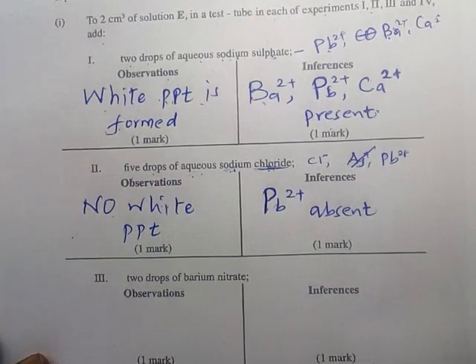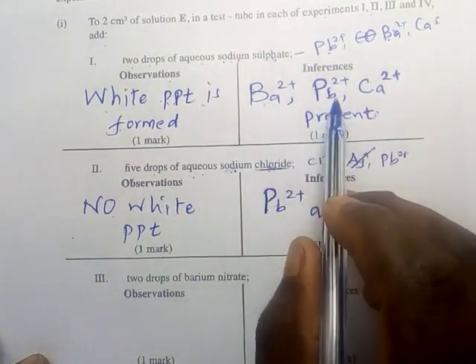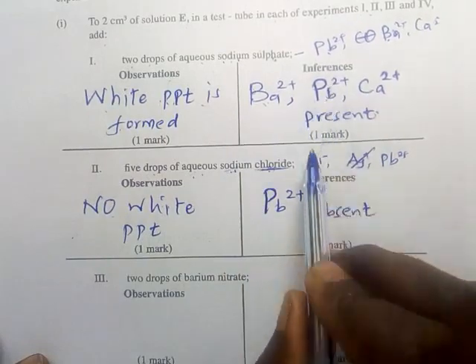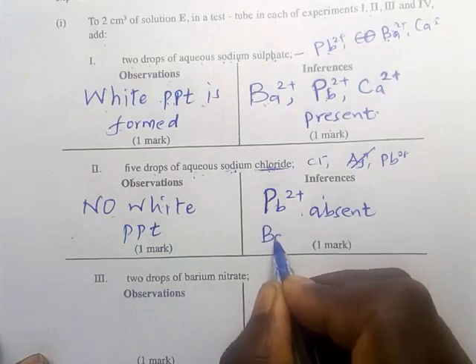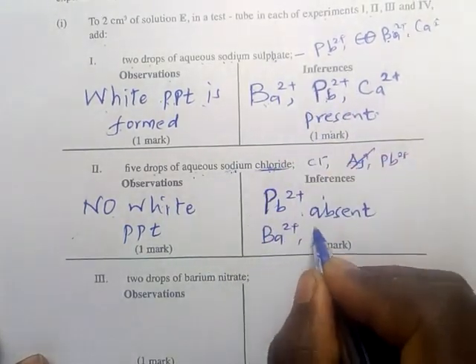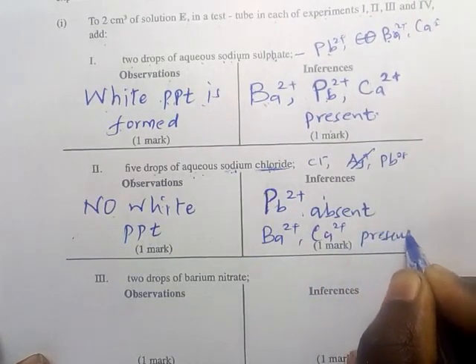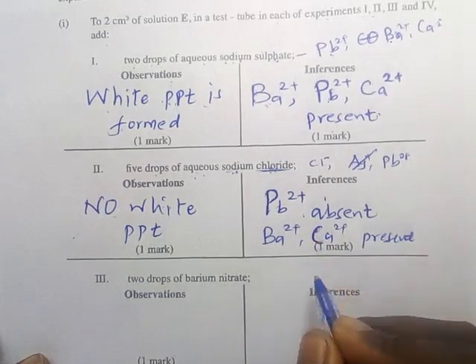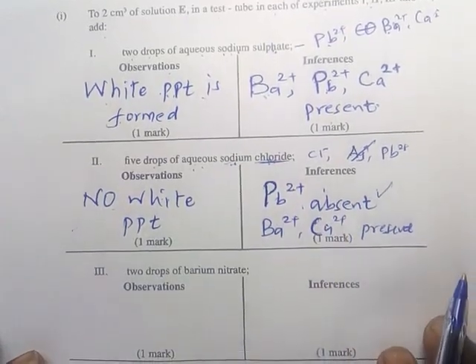Lead is absent. So if in our previous we had barium, calcium and lead, now lead is absent, then what is present? It means that barium and calcium, 2 ions, are present. That's what it means. But this one is correct also. You can just write lead is absent. It's accepted.